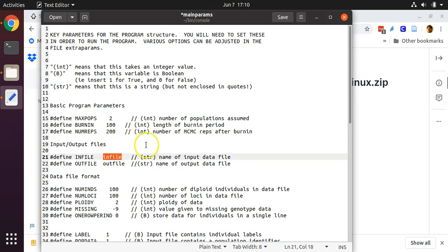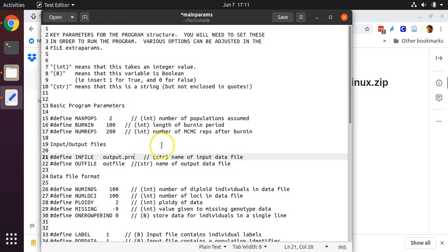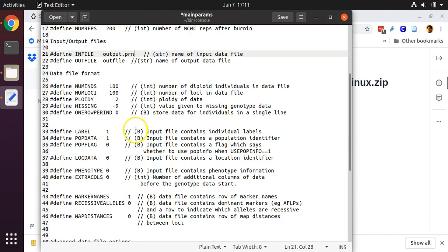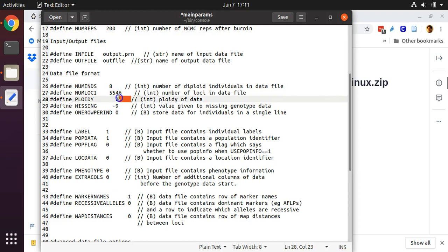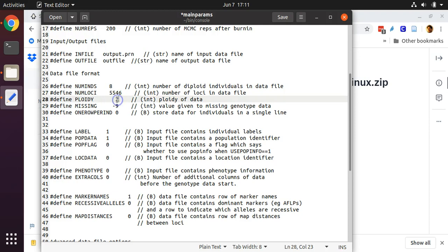The file that we will be using to run the STRUCTURE analysis on is called output.prn. As I told you previously, numins means number of individuals. There are eight individuals and there are 5,546 loci. The ploidy of our dataset is diploid, so we keep this number here as 2. The missing data value in our dataset is negative 999.